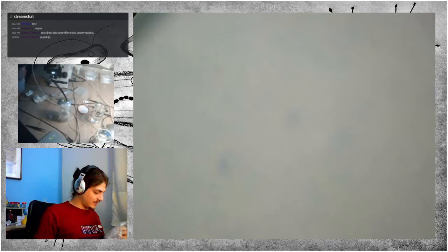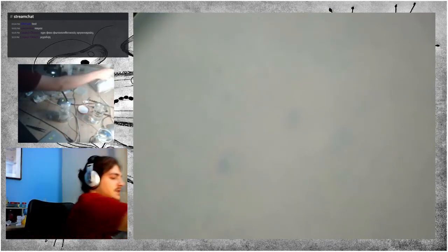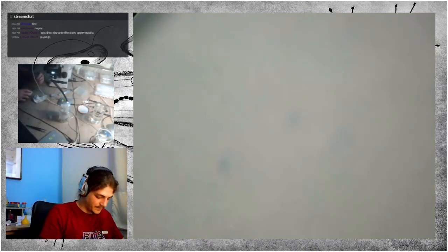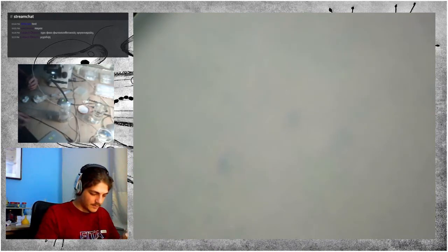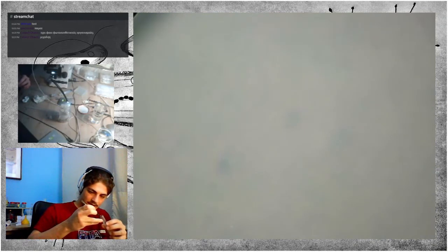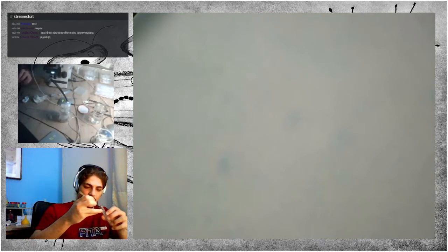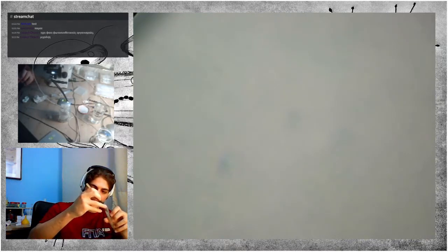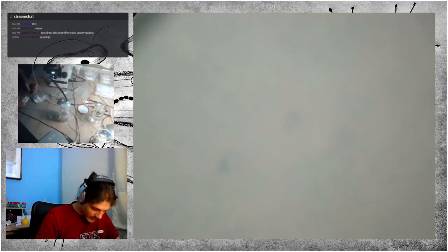Those are very handy because you can transfer water in very small amounts. But what I'm interested in most is the biofilm, which is in a few large pieces. There we go, just took one out.